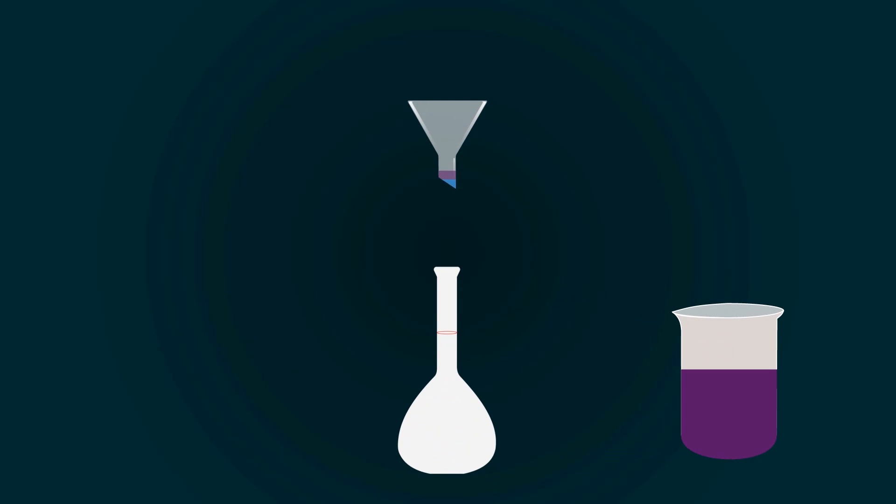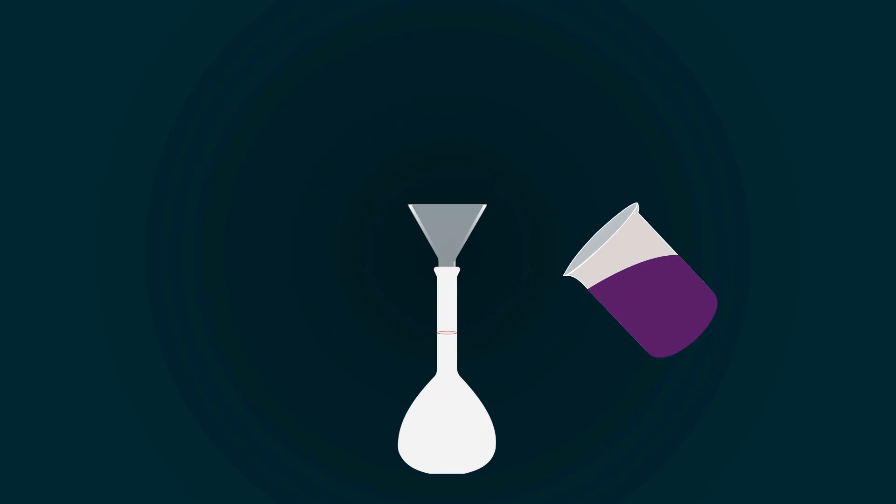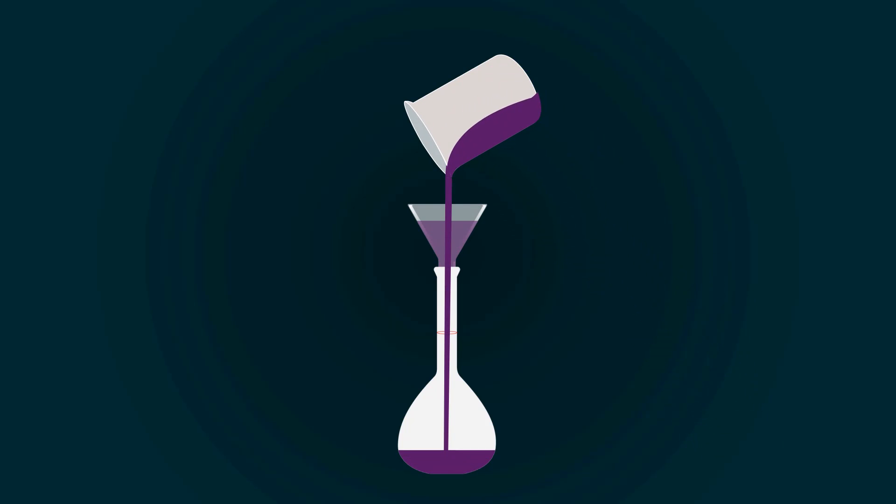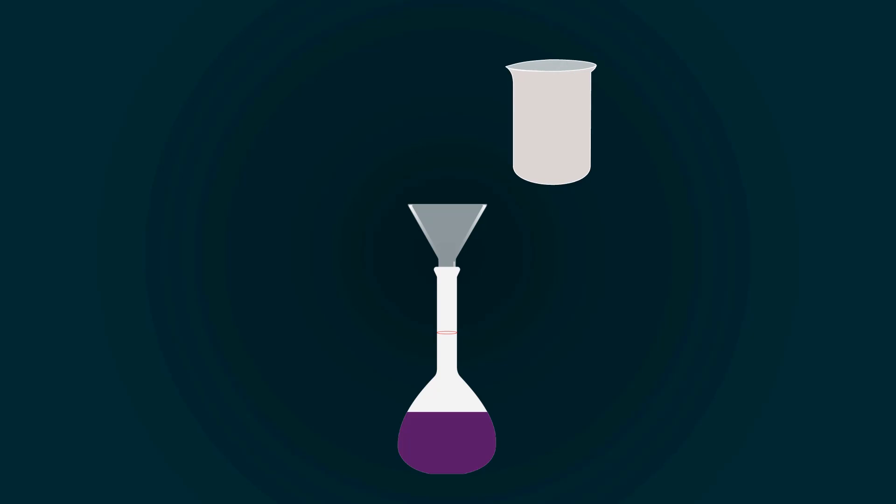Now pour all the solution into the volumetric flask with the help of the funnel. You have to fill the volumetric flask up to the 1000 milliliters point. For that you have to add more distilled water.